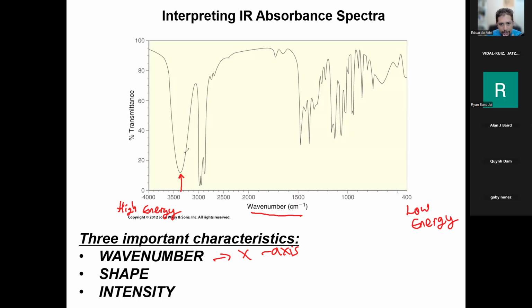3350. Let's see, yep, that looks about 3350. That would be considered acceptable. It could be 3355, 3357, right? That's the whole point of significant figures. We can only guess up to what we're given. We can't make that exact a measurement. So yes, that would be a peak at 3350. If you have a question about it, you will ask me, hey, that peak at 3350 wave numbers, what is that? Now I know which one you're talking about.